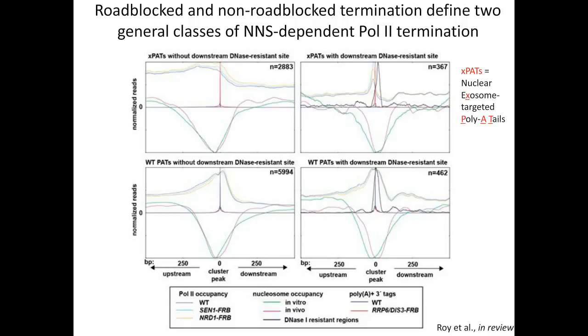And so we can see that there is an accumulation of RNA polymerase at the ends of these genes at the 3' processing sites, and this is in agreement with previous studies. But we don't see the same behavior. So we can conclude that we've identified that the NNS pathway utilizes these two distinct modes of termination, and the 3' end sequencing allows us to precisely map exactly where the RNA polymerase is terminating in the case of these nuclear exosome targeted poly A tails.